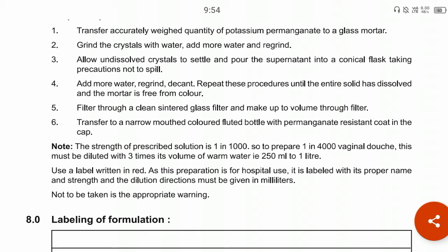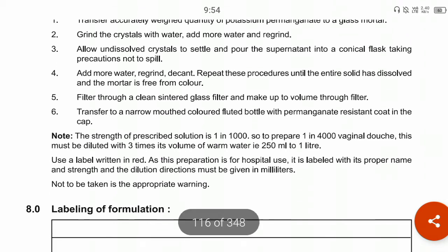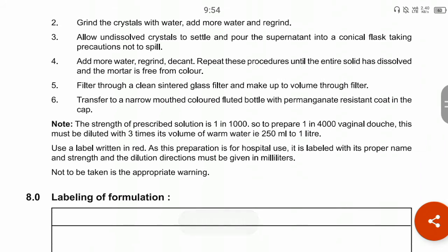Grind the particles completely, then filter the solution through a sintered glass filter and make up the volume through the filter. Transfer the preparation into a narrow-mouth, colored fluted bottle with a permanganate-resistant cap.